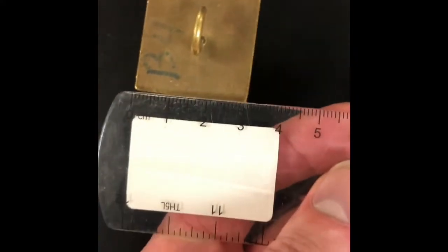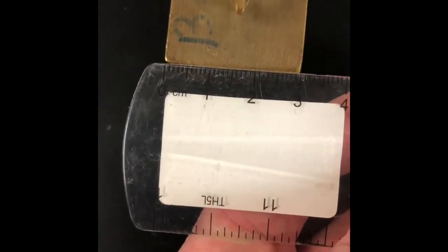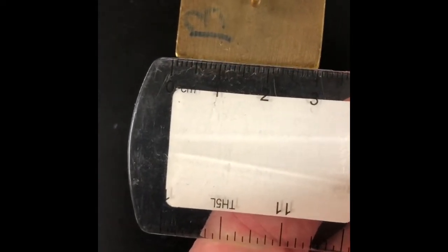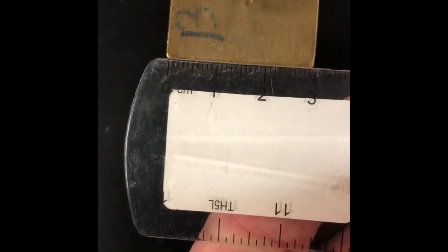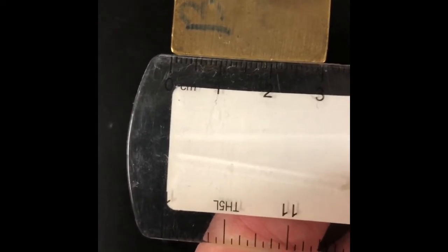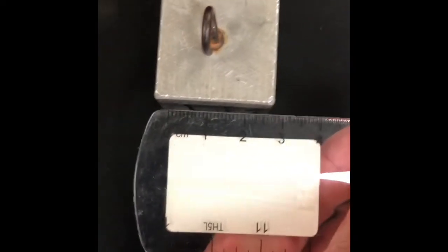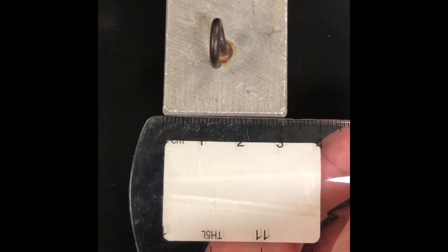Now, to get the volume of the solid, we're going to measure the length, the width, and the height. Block, we're going to measure using centimeters for all 3 sides. Now, as you can tell, it's kind of hard to hold steady and videotape at the same time. But the length is going to be about 3.1 centimeters. And this one is going to be about 3.1 also.